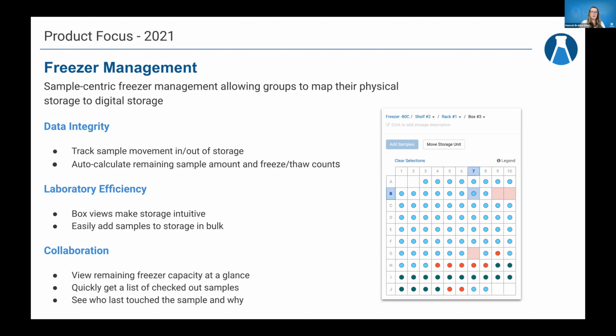In terms of efficiency, displaying box views as you see here to make that storage intuitive. So if you're lucky enough to be looking at a screen as you're in the freezer, you can very quickly, easily map what's in your box with what's being displayed on the screen.